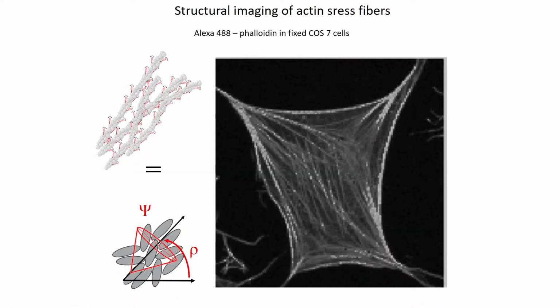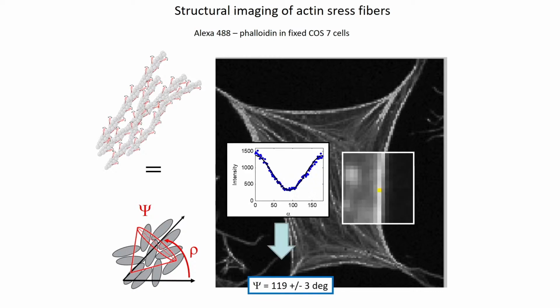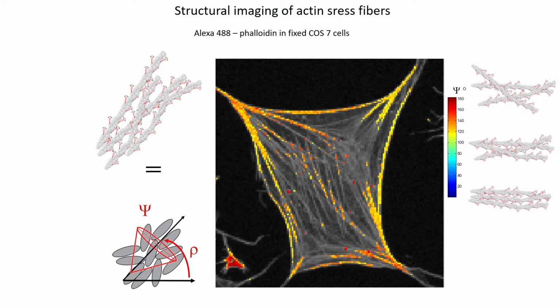So what we measure in the end is a fluorescence image, but per pixel we add the information of the modulation of the fluorescence signal, which is due to the rotation of the excitation polarization. And we encode that in a color, which is called molecular order, from very reddish, if molecules are exploring a very isotropic orientation of angles, to very bluish, which means that molecules are highly organized.